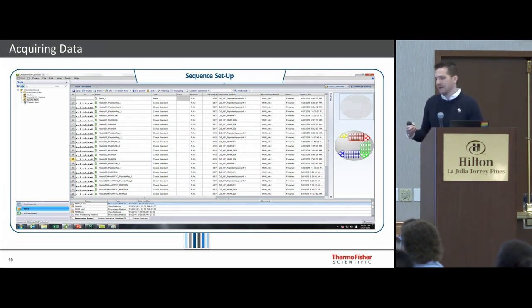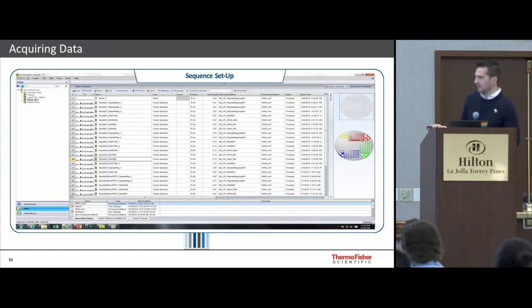And what you're doing here is you're taking advantage of the fact that you can access high resolution. The only tricky part here is you just set the resolution, and that's it. You tell the Q Exactive, do extra work, get me the highest quality data possible. But it doesn't make the method any more complicated. The LC method is pretty straightforward, the one I showed you earlier.